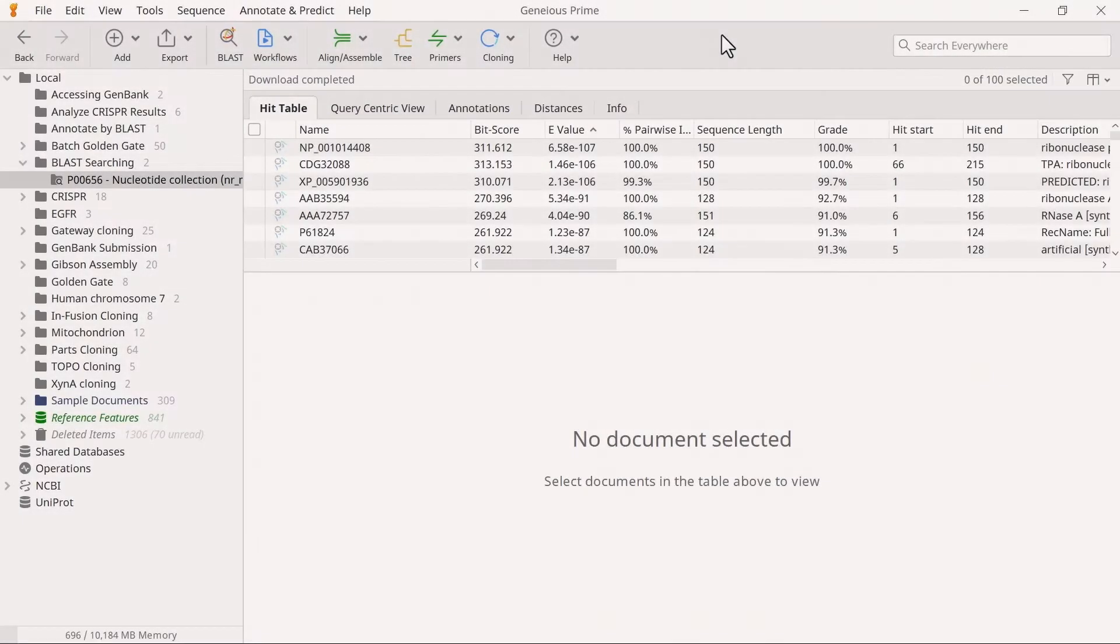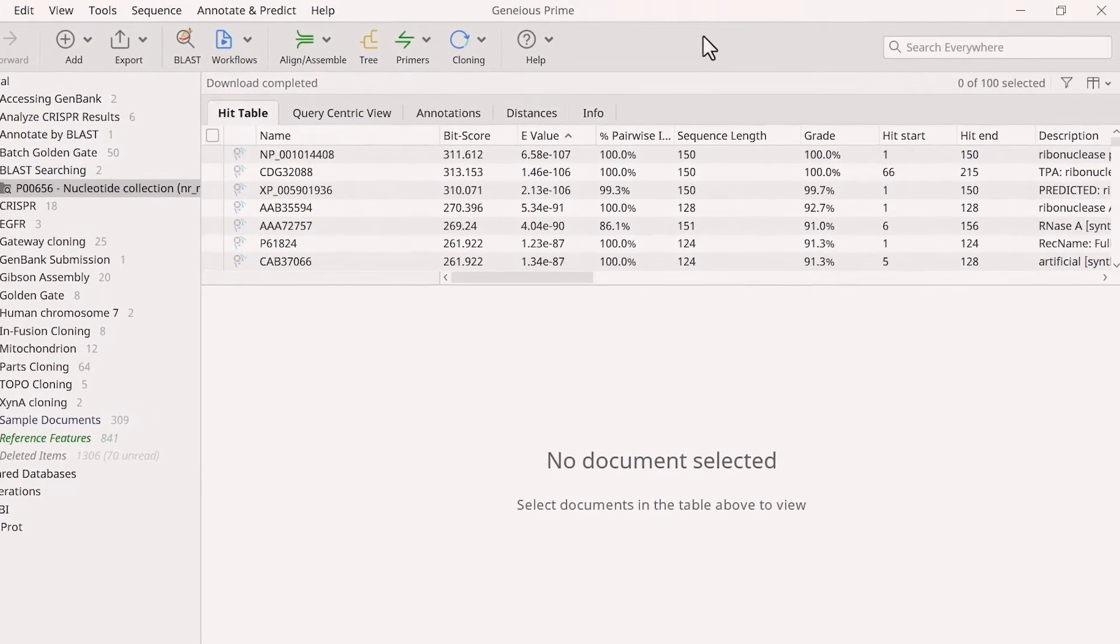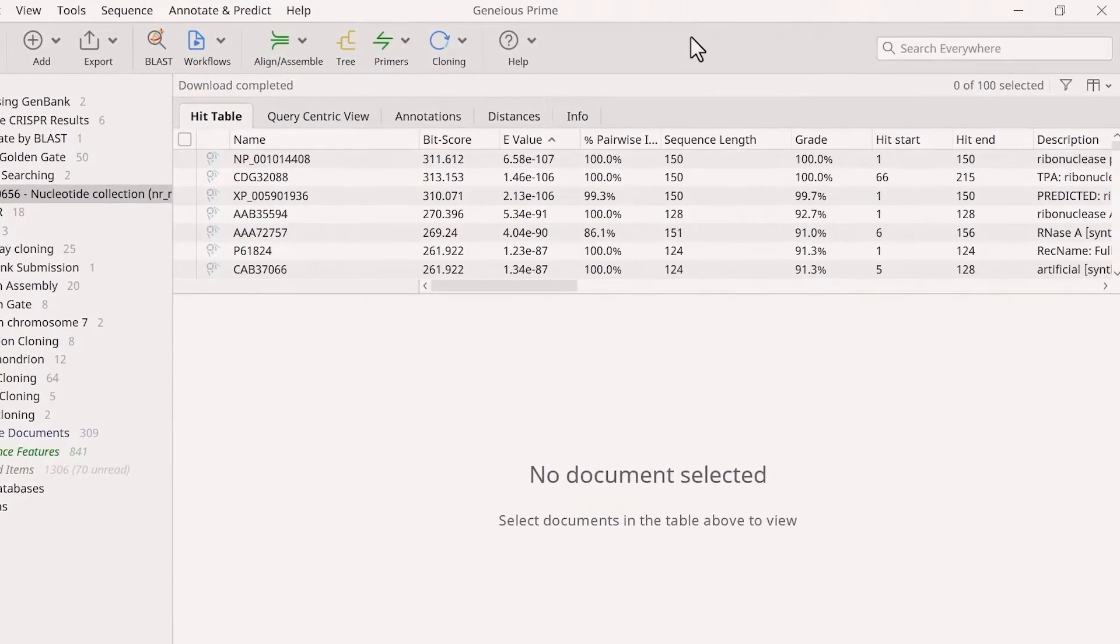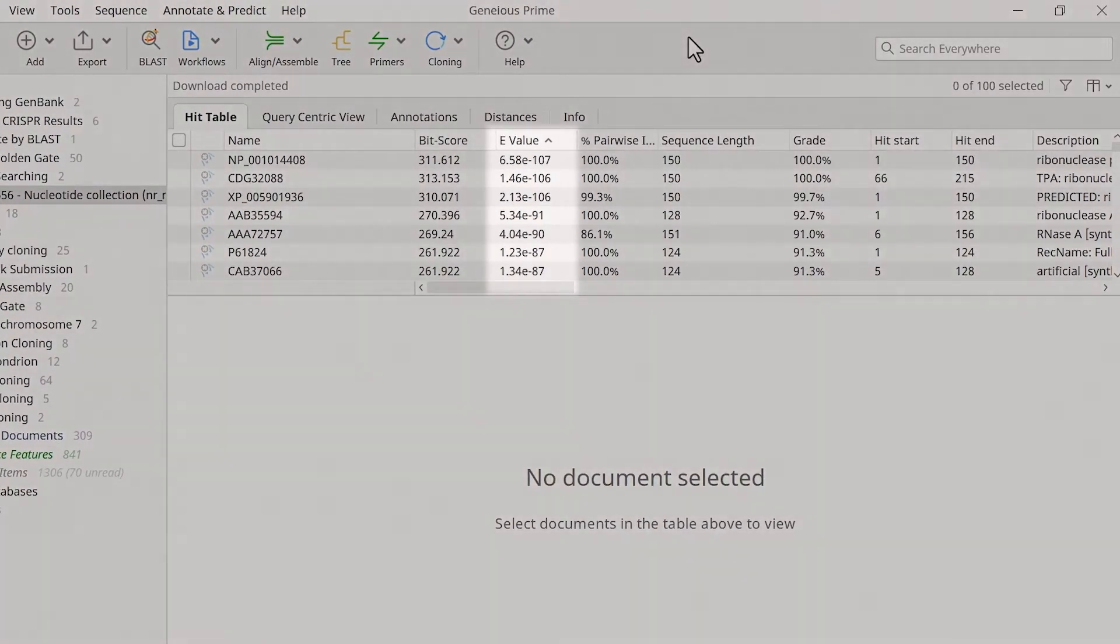When the BLAST search completes, all results will be downloaded from NCBI and placed in a new folder. The hit table contains a summary of the matching hits, including the e-value.